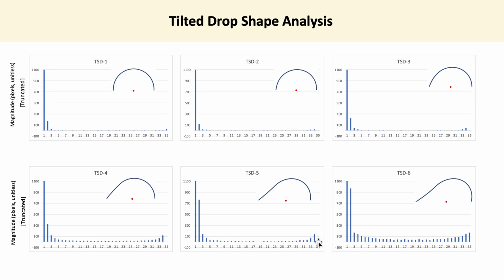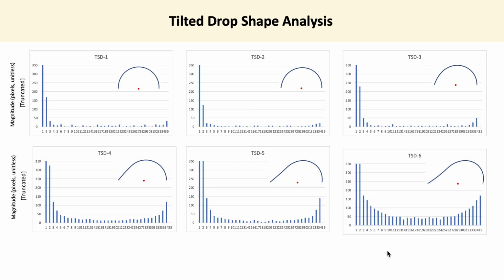If we were to have shapes representing every continuum from shape 1 to 6, we could actually measure quantitatively, create an index that measures the threshold of transitions between shapes, and we might even find certain threshold cutoffs. Zooming in even further, we see the distinct shape of the bins, representing the leaning of the droplet towards the right.